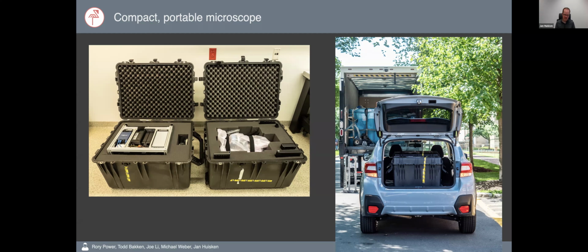And sometimes one of us comes along and helps setting up the instrument. Sometimes a manual is just good enough, or we can remotely assist people in setting up the instrument. So in terms of the laser, it's actually not the most difficult. Again, it's just that one fiber and then a few cables you have to connect. And that's never really been an issue.